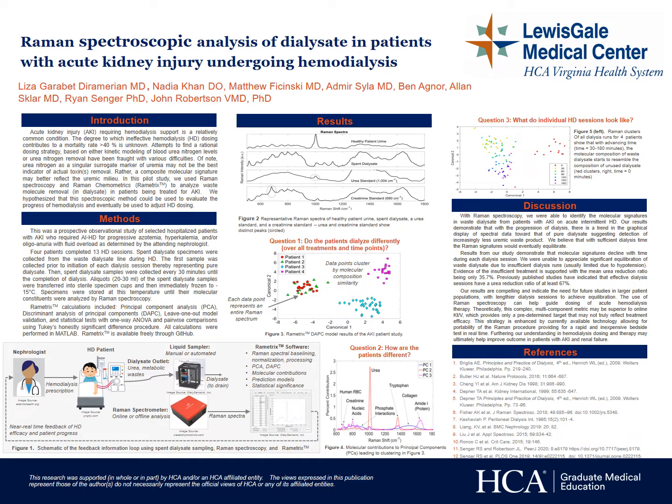The duration of hemodialysis treatment is generally prescribed for patients with acute kidney injury without attention to any particular kinetic modeling strategy. The possibility that suboptimal dosing of dialysis may contribute to the high mortality rate of acute kidney injury led us to determine whether spectral analysis of the products of dialysis might allow for more rational timing of the procedure.